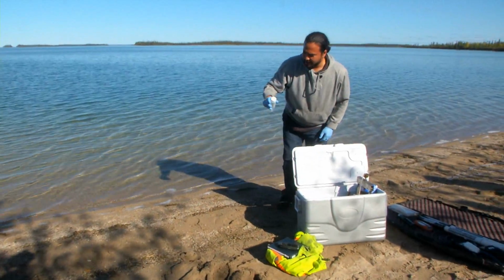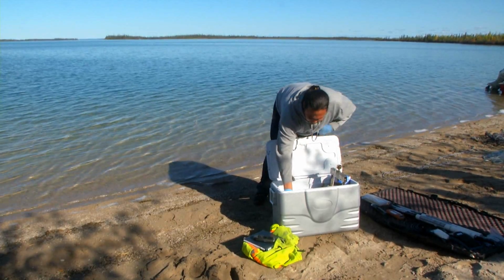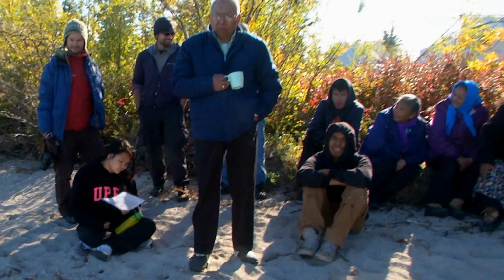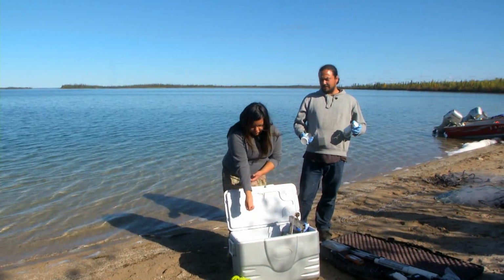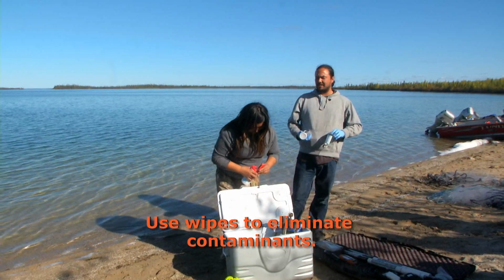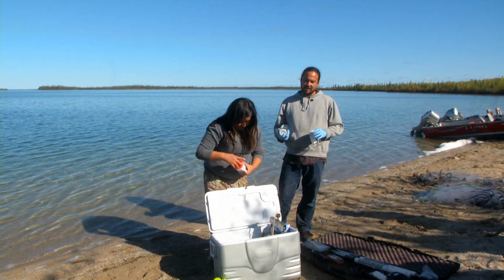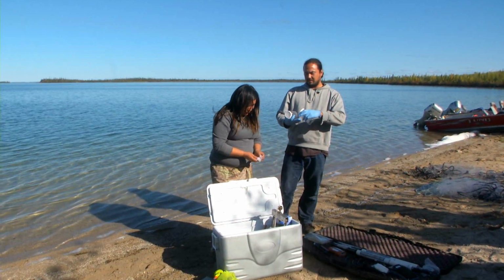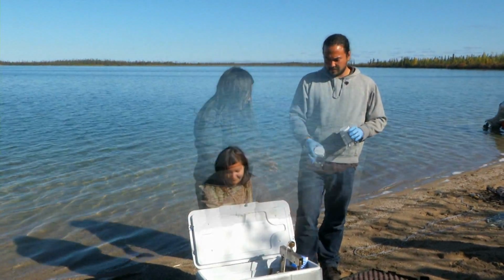So for red, that would be dissolved metals. And at every site, we'll be collecting 3 different types. And they'll all be done. And the wipes, again, is to get rid of any contaminants. If a person smokes, you should try not to smoke 2 hours before doing these samples, because the nicotine will actually get into the water samples and make changes to it.